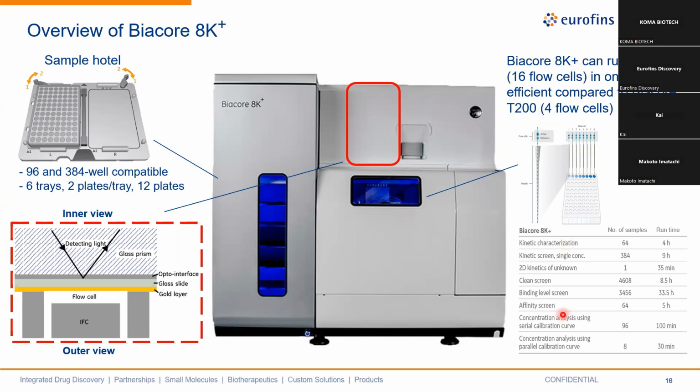And here at the bottom, it shows that we have 8 different needles, the syringes that can draw sample from a 96 well plate or maybe a 384 well plate. They draw sample there and then start the experiment. So here at the bottom, you can see how fast and efficient it is.